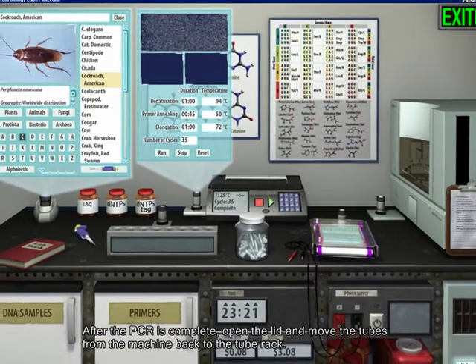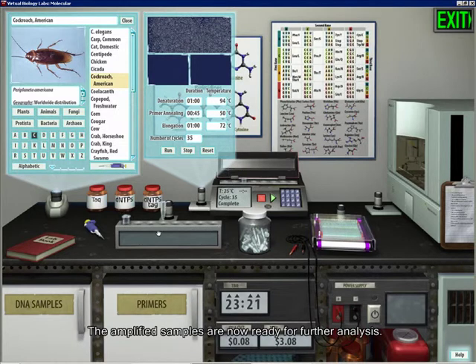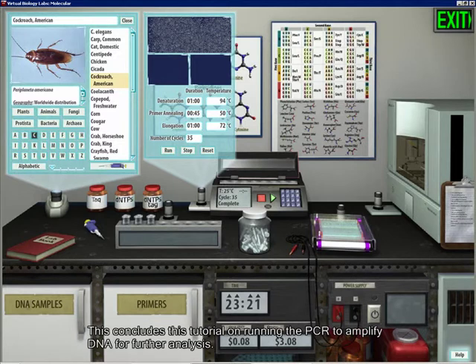After the PCR is complete, open the lid and move the tubes from the machine back to the tube rack. The amplified samples are now ready for further analysis. This concludes this tutorial on running the PCR to amplify DNA for further analysis.